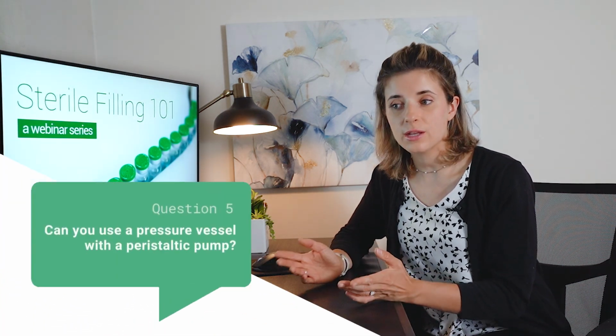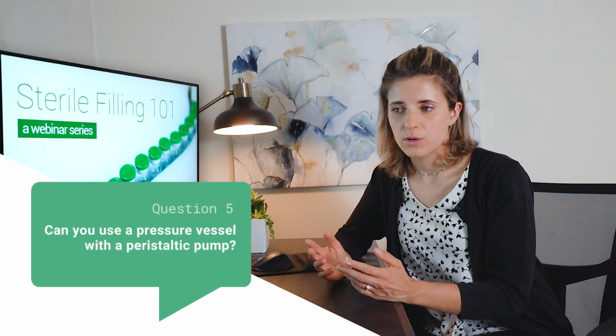Thank you, Ben. I have one more question. I'm going to direct this towards Shawn. Can you use a pressure vessel with a peristaltic pump? Certainly, you can use a pressure vessel with a peristaltic pump. You won't be able to use it at a very high pressure because the tubing inside the peristaltic pump is rated lower than the pressure that you could apply to the pressure vessel. Thank you, Shawn. That was well said.